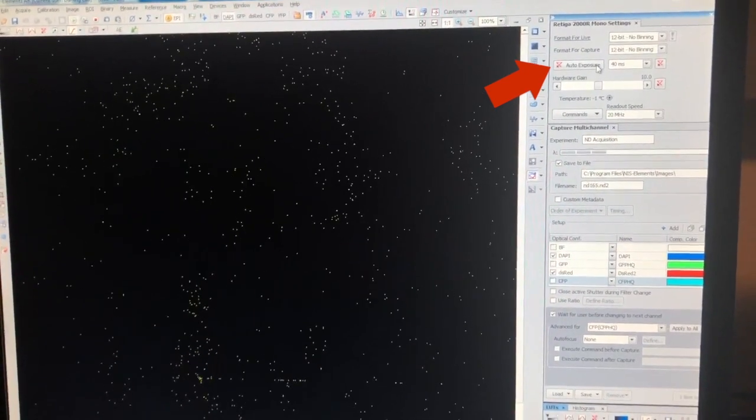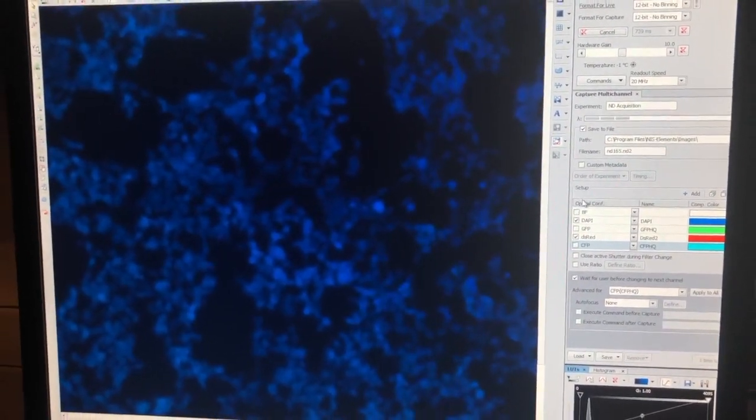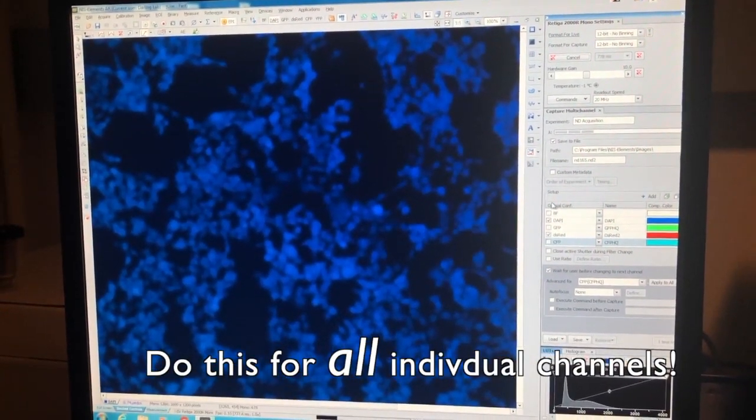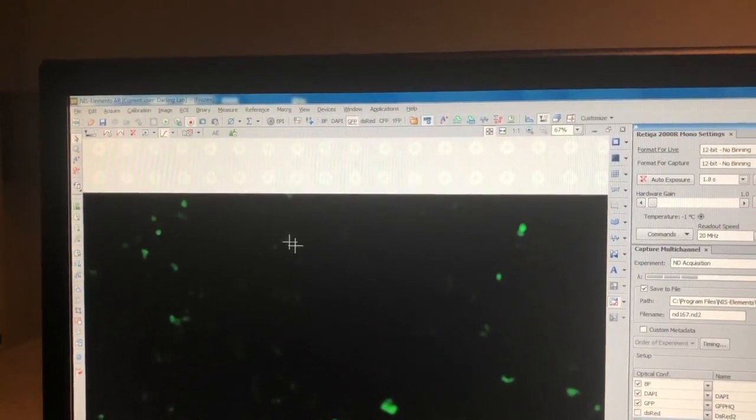Click Auto Expose in the Retiga 2000R mono settings to find a good starting point for how long to expose for good images, and you must do this individually for each channel you're going to use. Before moving on to multi-channel imaging, press stop.